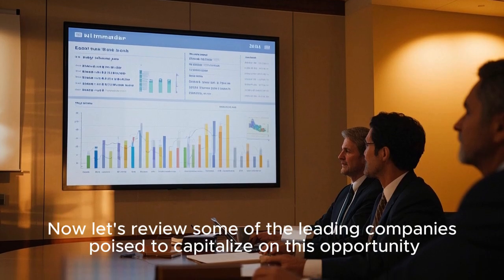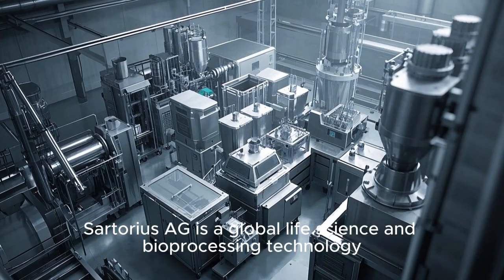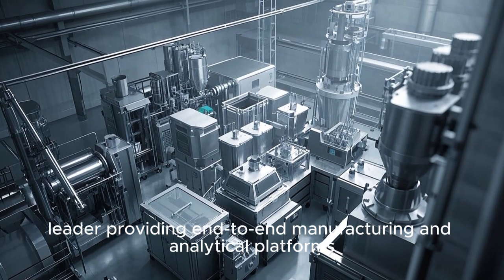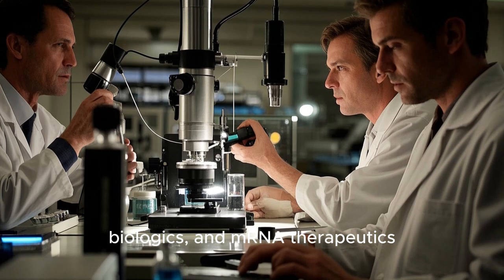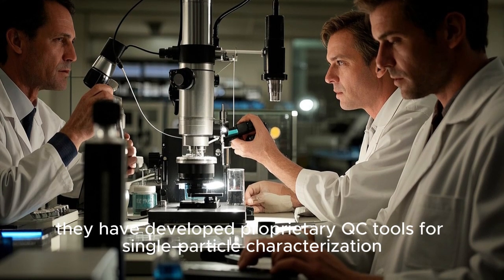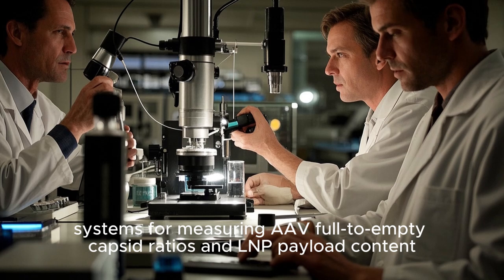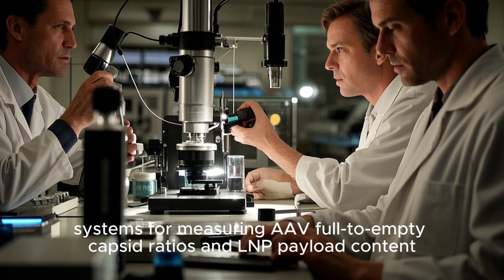Now let's review some of the leading companies poised to capitalize on this opportunity. Sartorius AG is a global life science and bioprocessing technology leader providing end-to-end manufacturing and analytical platforms. For cell and gene therapy, biologics, and mRNA therapeutics, they have developed proprietary QC tools for single-particle characterization, including optofluidic force induction (OF2I) technology and mass spectrometry-based systems for measuring AAV full-to-empty capsid ratios and LNP payload content.